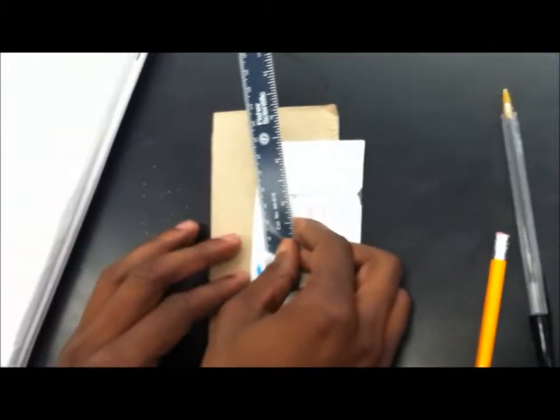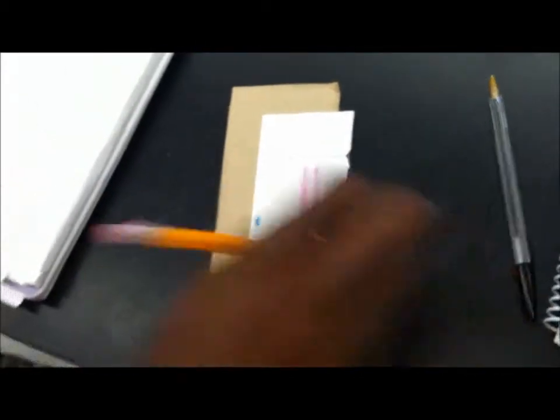We're going to measure it in centimeters with this ruler. All right, what we're aiming for is we're going to aim for the strongest point on the actual line. We're going from the line and we go up to it. And we'll say the strongest point on this one was one centimeter. So we're going to write down this as one centimeter.